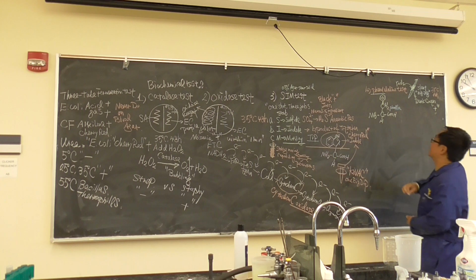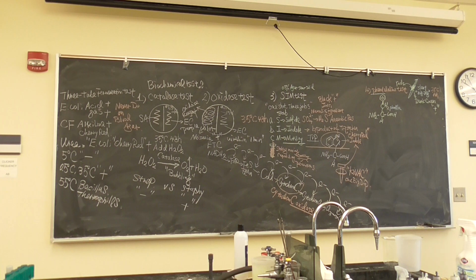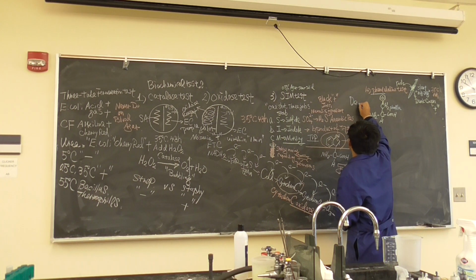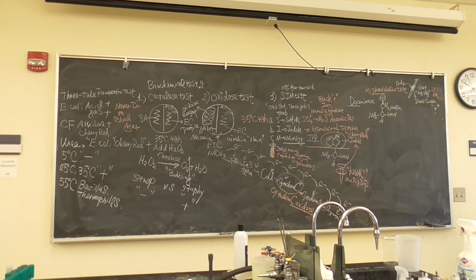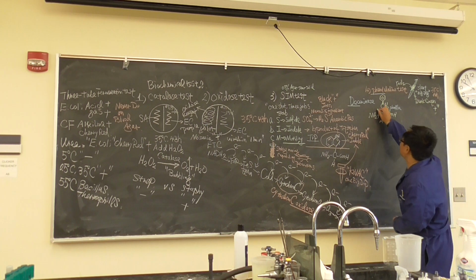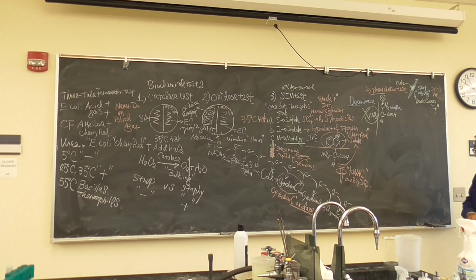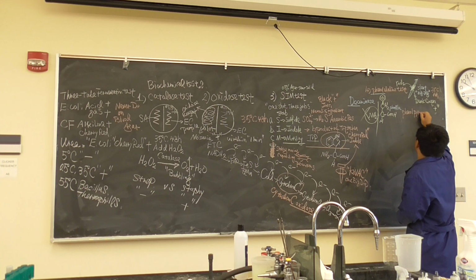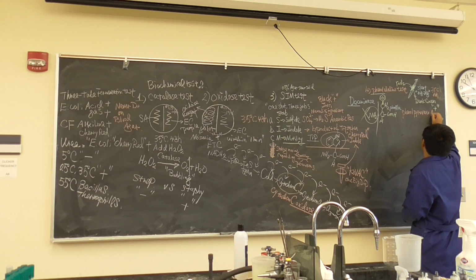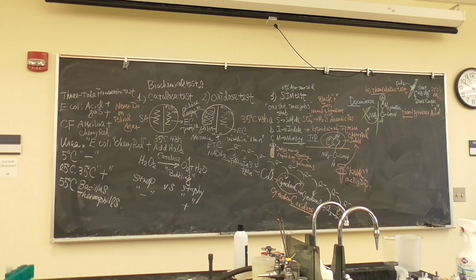Phenylalanine. Okay. Phenylalanine test, what are we testing? An enzyme called deaminase. What does the D mean? Take it out. So, if bacteria can use phenylalanine, they will take this guy out and break it down. What is this side? Phenylpyruvic acid, a modified pyruvic acid. Why is it important?